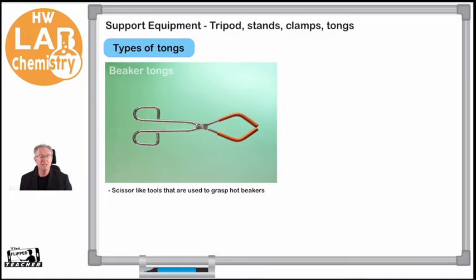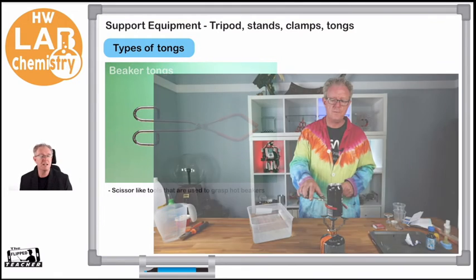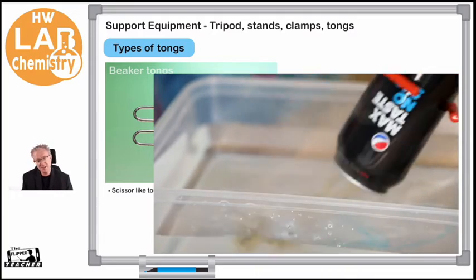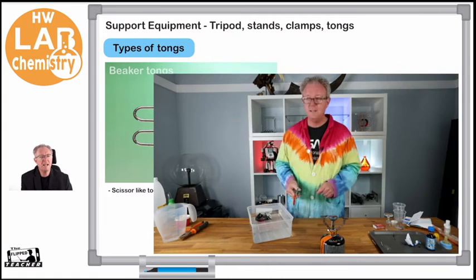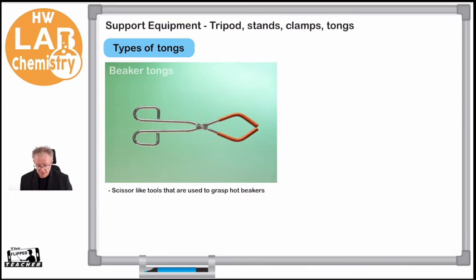Now for beaker tongs. There are two main types of tongs we use in the lab, and the first is beaker tongs. They're called beaker tongs because they hold beakers. The ends of the tong have a wider mouth, with rubber or plastic to give improved friction so the beaker won't slip when grabbed from the sides. Here's a demonstration — I had to use beaker tongs to hold an aluminium tin can and invert it quickly, needing good friction. It works the same when taking a beaker off a tripod to cool it down.